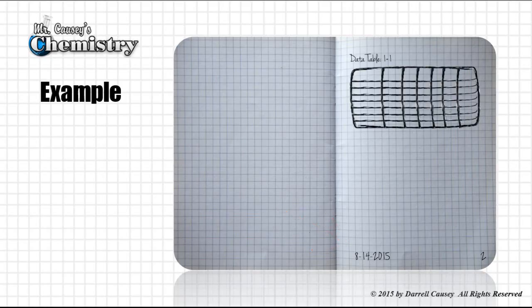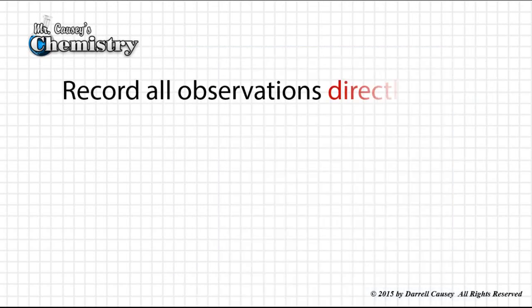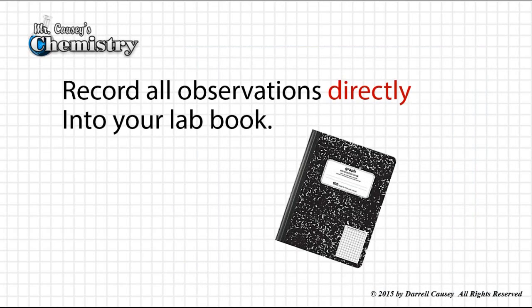Remember, we only use right-hand pages and put in the date. There's a data table, but that's not a very good data table. Let's use rulers whenever we make a data table or graphs. There you go. Looks much better. Record all observations directly into your lab book whenever you're doing a lab. Don't write it other places.